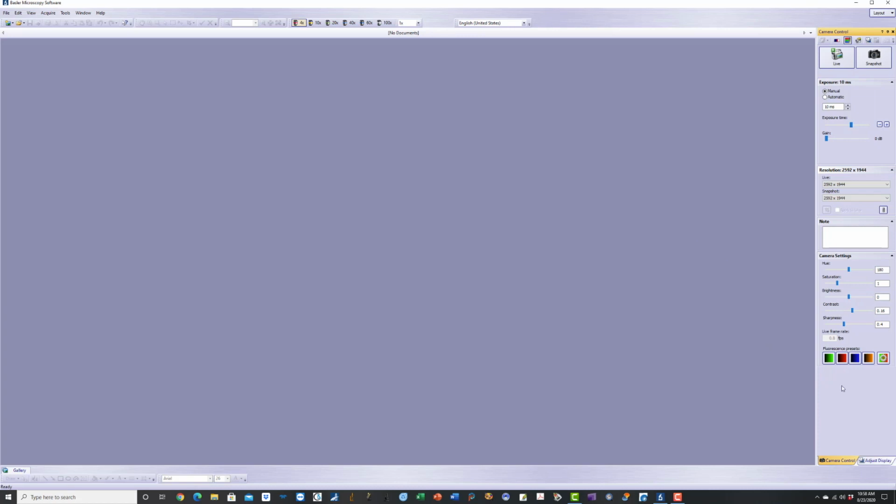And you have different presets, fluorescent presets. We can set the preset when we do the fluorescent thin section, but when we do the regular blue dye mixed epoxy impregnated thin sections, we don't need to worry about fluorescent preset. Or when we do the plain polarized light or cross polarized light mode of fluorescent dye mixed epoxy impregnated thin section, we don't need the fluorescent preset unless we go to the fluorescent mode by using a barrier filter and excitation filter combinations.